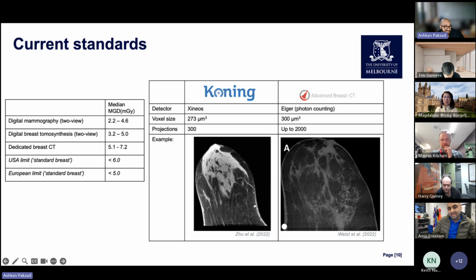I suppose it depends on what resolution you want in your segmentation. And I imagine the people sitting around you, the colleagues at IMBL, are more qualified to say how many projections you can take.